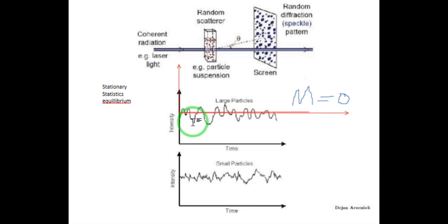So what we can do is use the idea of correlation and compare this signal at time t exactly with this signal at time t plus tau. Consider it as tau. I'm sorry, because I'm using the mouse of my laptop and I don't have the stylus, so this is the only way for me to write.